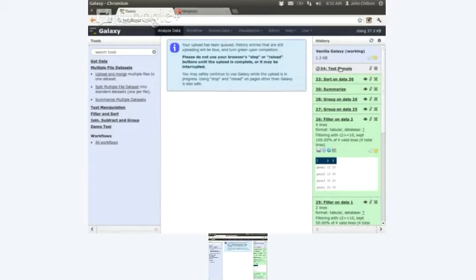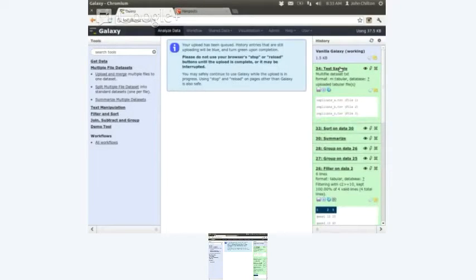There's one other way to create a multi-file data set right now, and that's using a directory if you've got FTP enabled. As we can see here now, we have a multiple file data set. We've got our replicates, our file names here. Instead of seeing the contents of one file, we just see file names. Under format, this is a little different. Instead of being a tabular file, this is an M-tabular file, or a multi-tabular file.